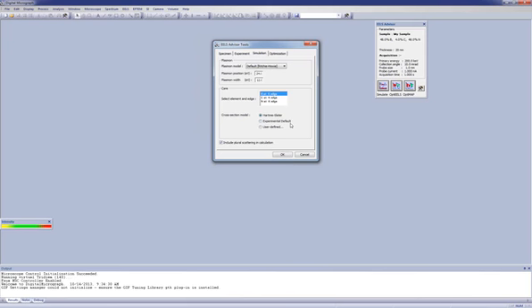These are sometimes useful when we have edges that are difficult to model using the Hartree-Slater model. In that case, the software will automatically point to these experimental defaults. There is also a capability of using user-defined cross-sections, where if you have a cross-section file at a particular location, we can have the software point to that file and use it as the basis for the calculation.